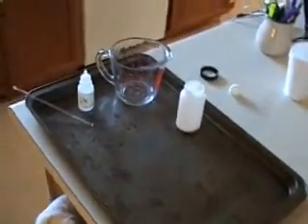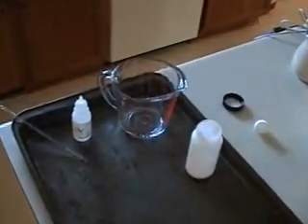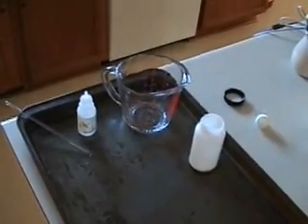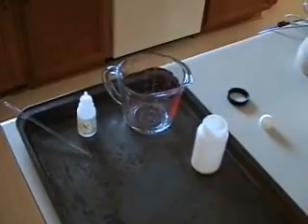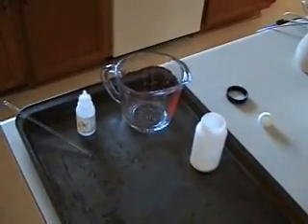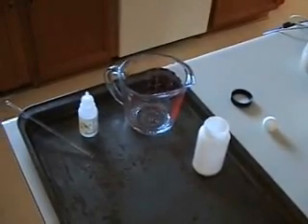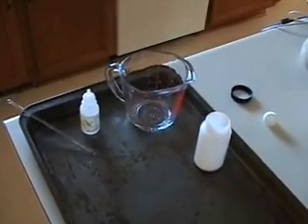Now all this material is going to be hot. Once you heat up the water, it's going to be boiling, so it's going to be hot to the touch. You want to be very careful, as safety is key in all these issues. In every experiment, you protect yourself from being cut, being burned, or being splashed, especially in the eyes. So wear your goggles.